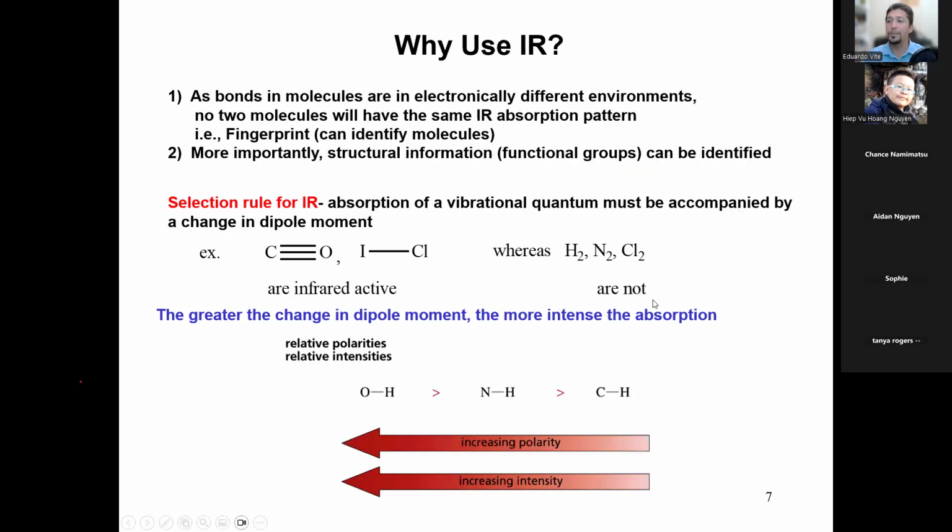So again, why do we use IR? Because the bonds vibrate at IR frequencies. That's really it. If the bonds did not vibrate with IR, we wouldn't use it. Very simple. However, one of your questions from the IR pre-lab quiz was, all molecules are IR active, true or false? And the answer is false, because while it is true that all molecules have bonds and all of their bonds vibrate, that doesn't mean that we can detect a signal, because ultimately we're using an instrument, a detector.